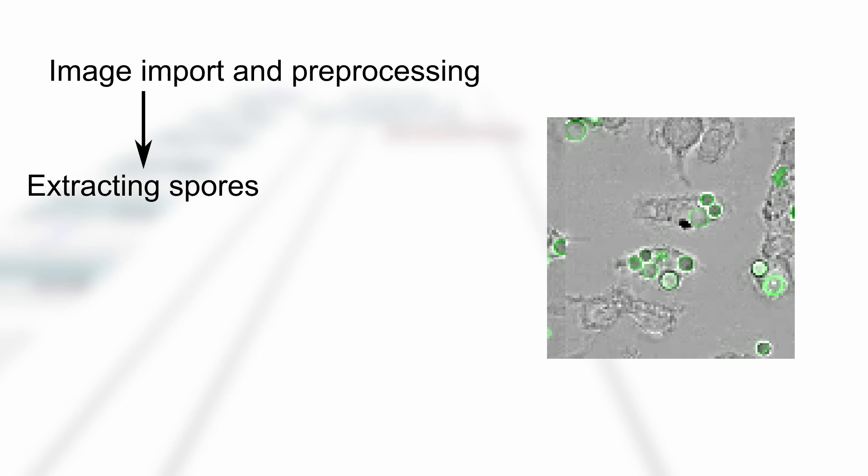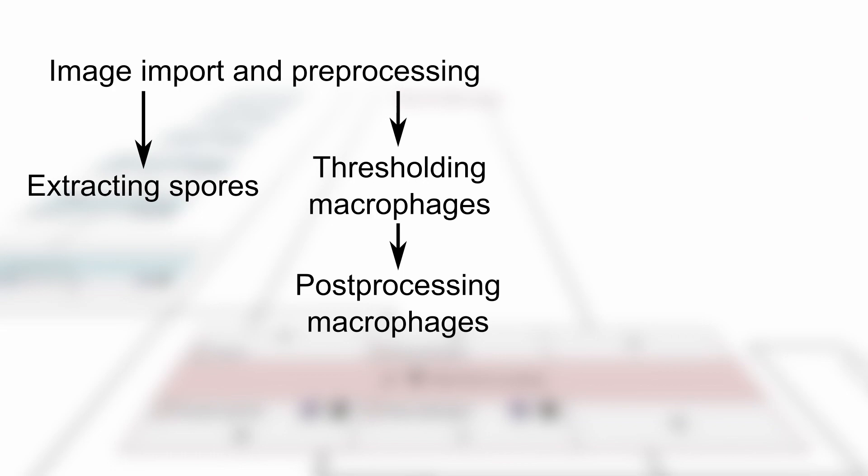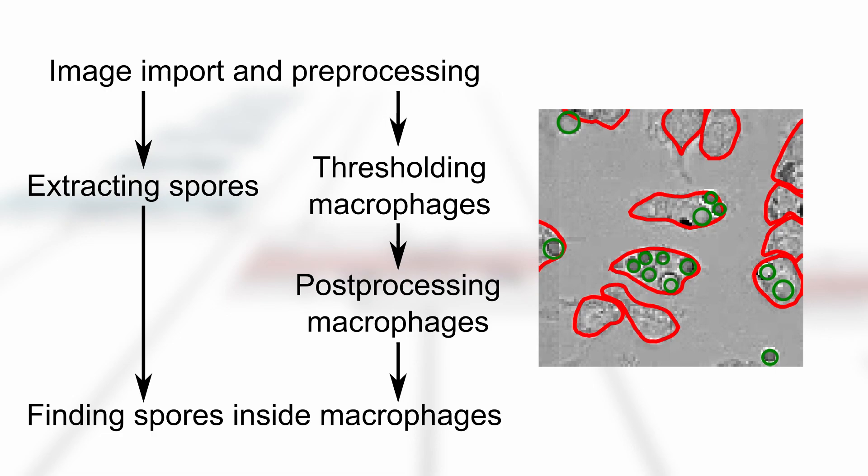The processing will start with importing the images and then carrying out some preprocessing. In the next step, we will then identify the fungal spores and then we will carry out the rough segmentation of macrophages, followed by post-processing. And finally, we will identify those spores that are actually inside the macrophages.